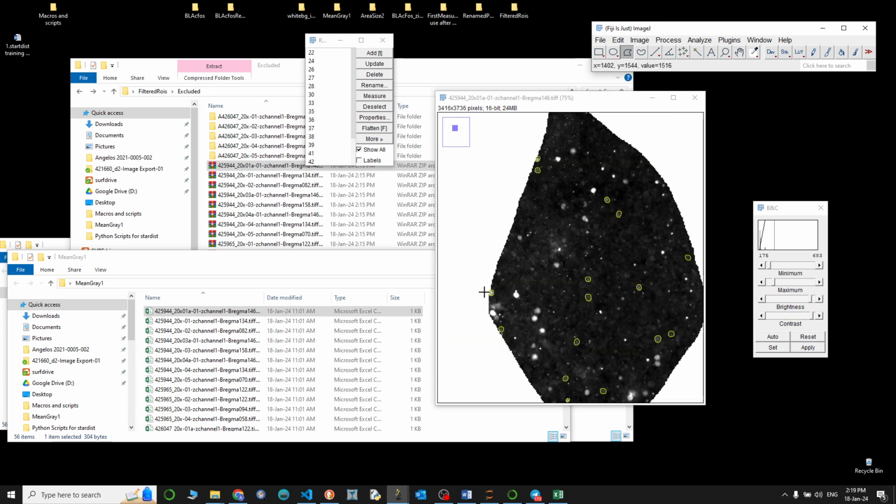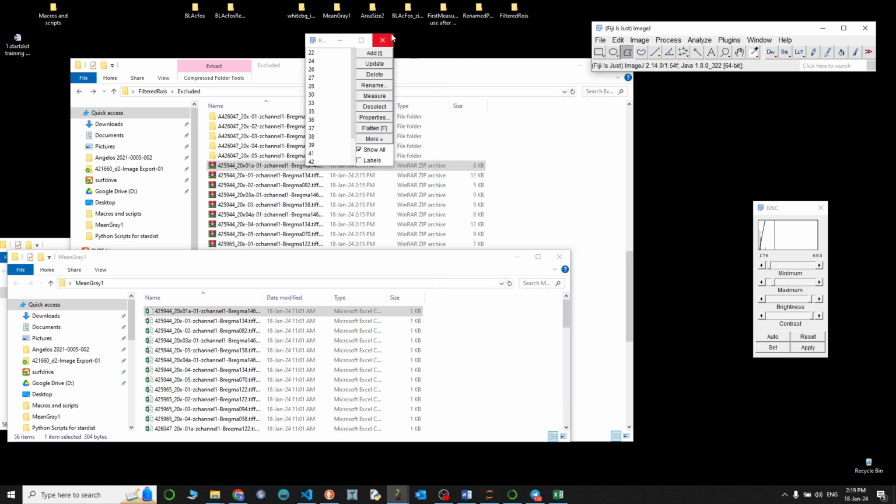But no worries, because we can solve it, the ones that are falsely excluded. But overall, you would want your script to exclude more regions than the erroneous predictions. And I think even in this case, this is done.